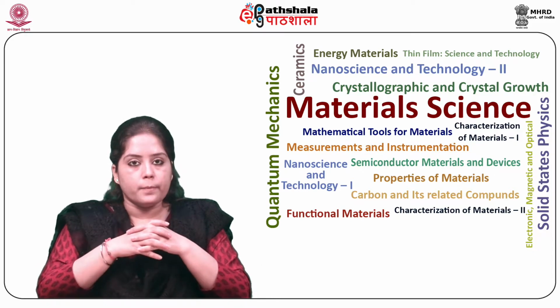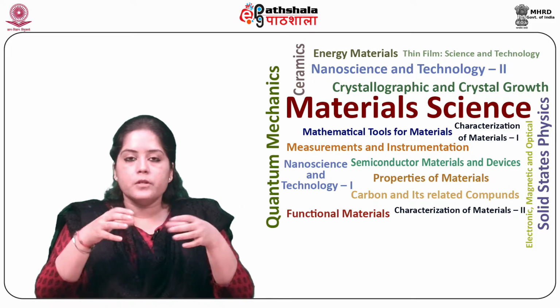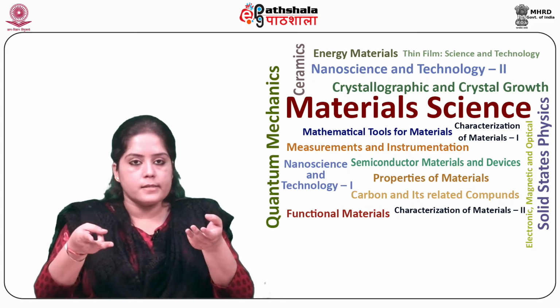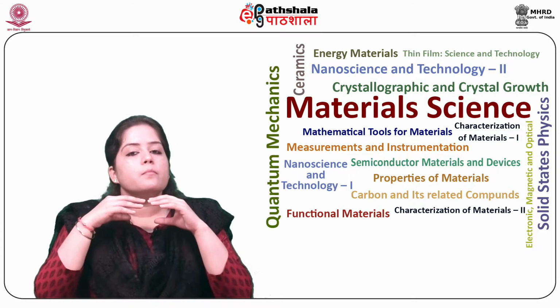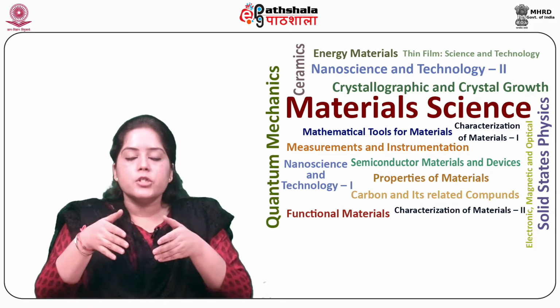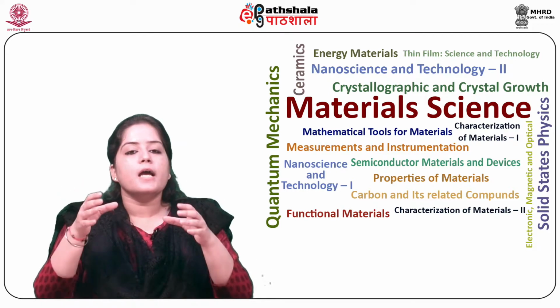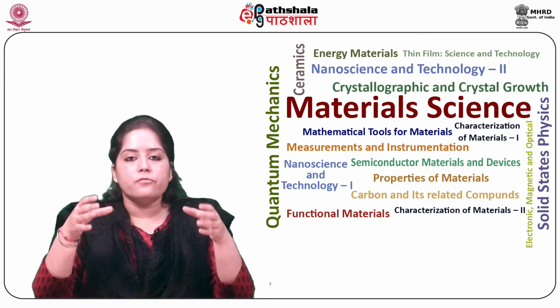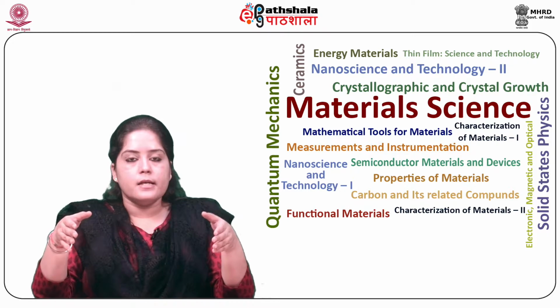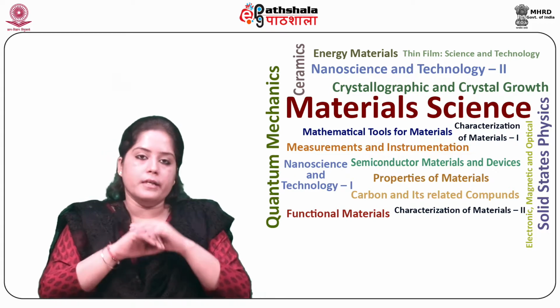FTIR spectroscopy is a technique that uses infrared light to observe the properties of a solid, liquid or gas. It is used in many different applications to measure the absorption, emission and photoconductivity of matter by shining a narrow beam of infrared light at the matter in various wavelengths and detecting how the matter responds to each wavelength.